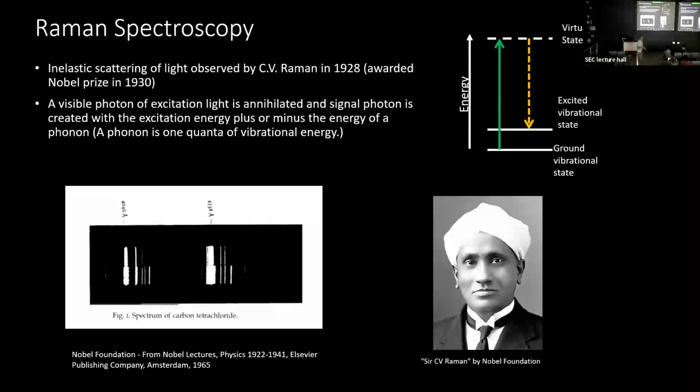So in PCR, in the polymerase chain reaction, you have this amplification of the number of copies. And in Raman, we don't have that amplification of the molecules of interest. So if you're starting with 10 copies, we've got to measure from 10 copies, that's it, which ends up being challenging. In the polymerase chain reaction, you start with 10 copies and then you copy them and you have this amplification, which is how you can end up detecting it.